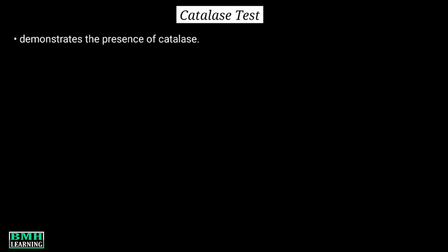This video is about Catalase test. The test demonstrates the presence of catalase. Catalase is an enzyme which catalyzes the release of oxygen from hydrogen peroxide.